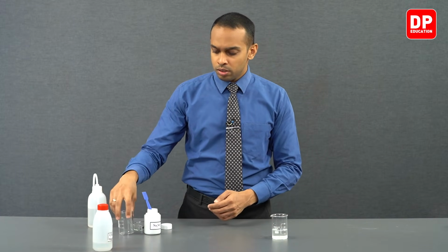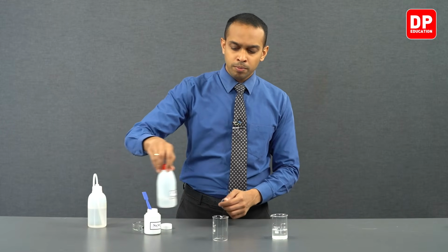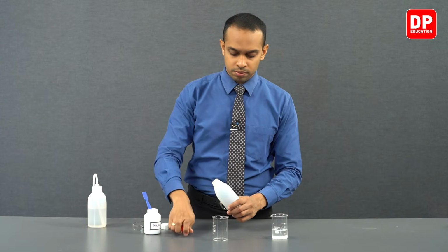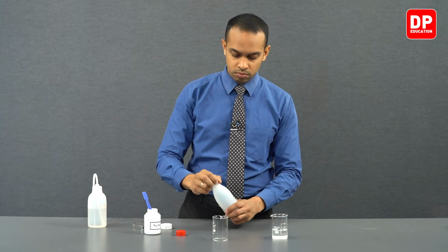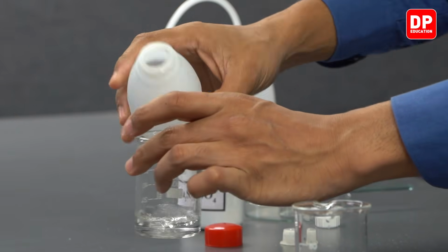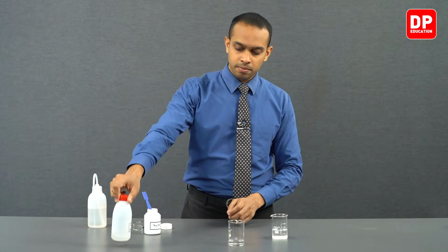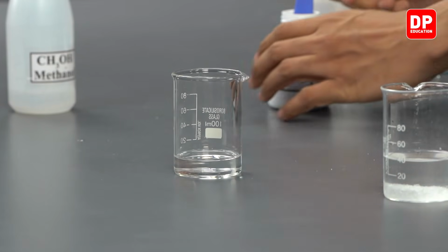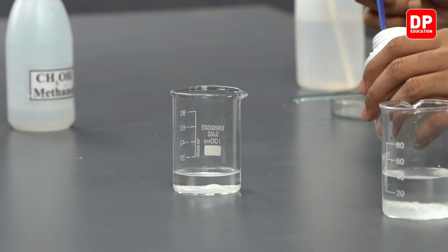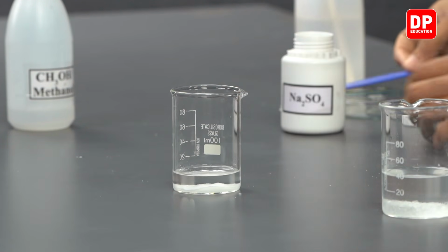Now, let's do the same to a small volume of methanol. We have our methanol here. Let's take a small amount of methanol into our beaker. And let's add a spatula full of sodium sulfate and observe whether it forms clumps in methanol.